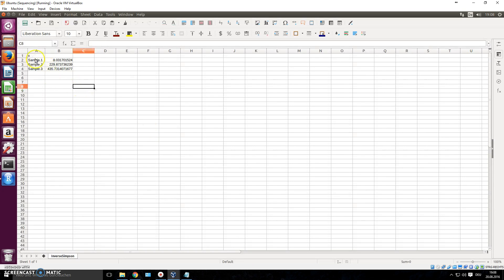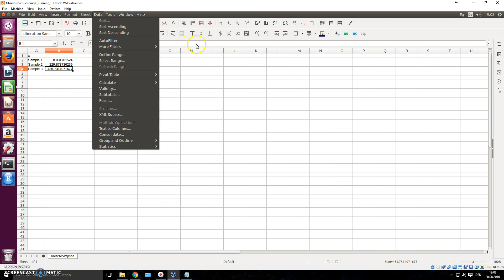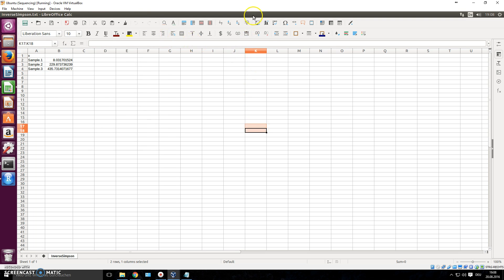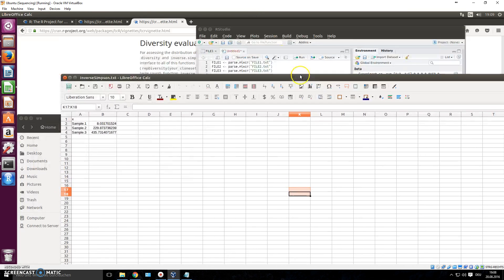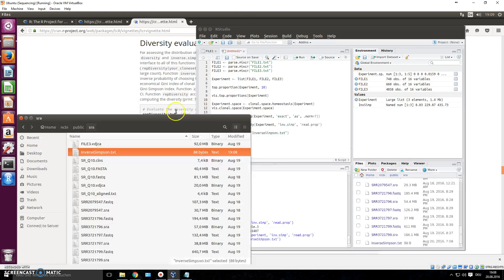So now you have your inverse Simpson index right here for sample one, for sample two, for sample three. And you can do this with anything in R, you can write anything into file. And that's the cool thing about it.